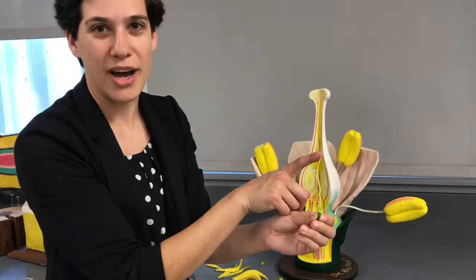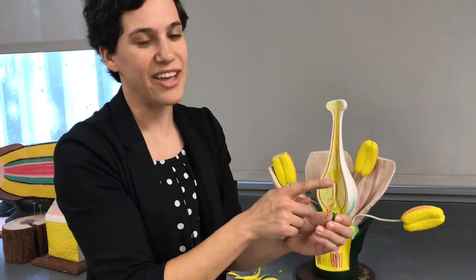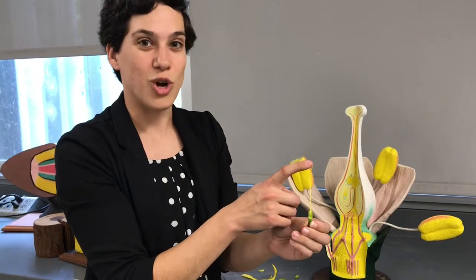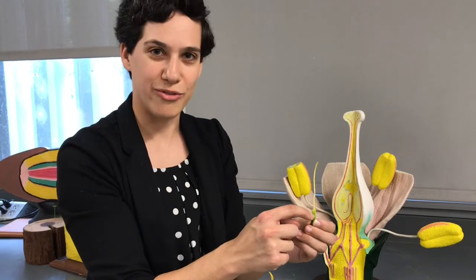We've got three parts of the carpel. We've got the stigma, which is sticky. That's where the pollen will stick to. We have the style, which is really long. And the pollen will actually grow a whole long pollen tube all the way through the style down to the ovary.